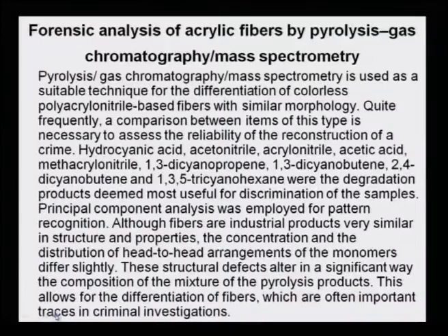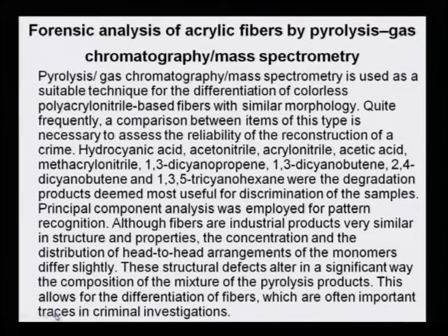These are various components that would derive from a big macromolecule of acrylonitrile fiber, and if these are present, that is a clue that it is an acrylonitrile fiber and that these components have come out of degradation. Principal component analysis was employed for pattern recognition.